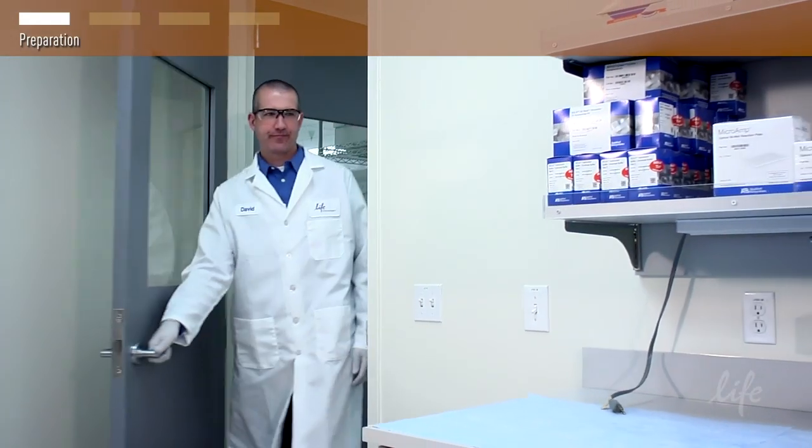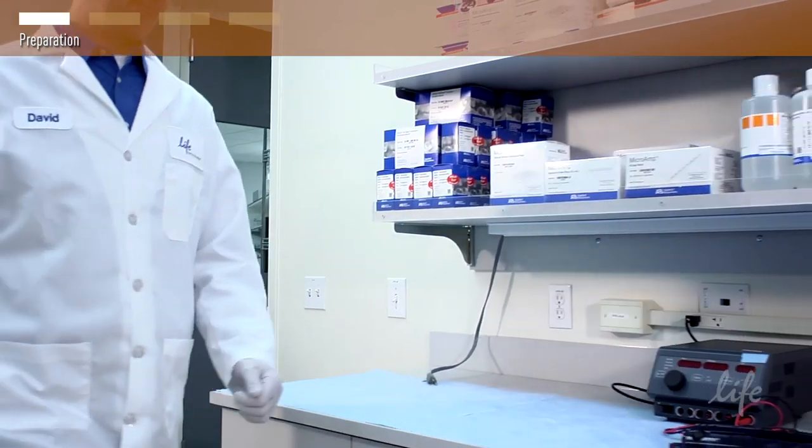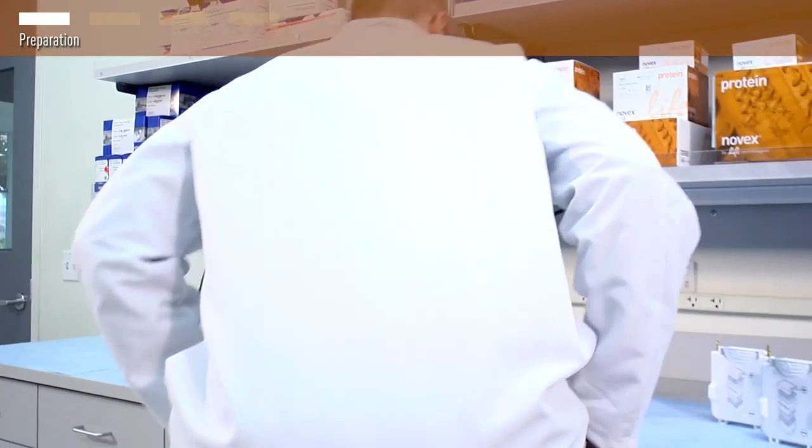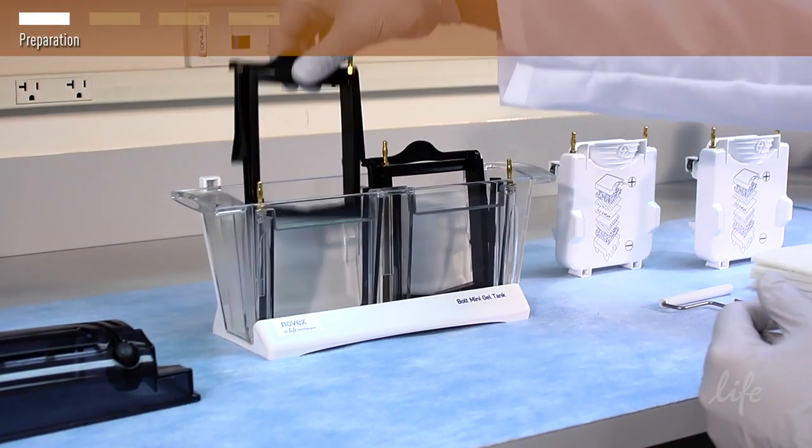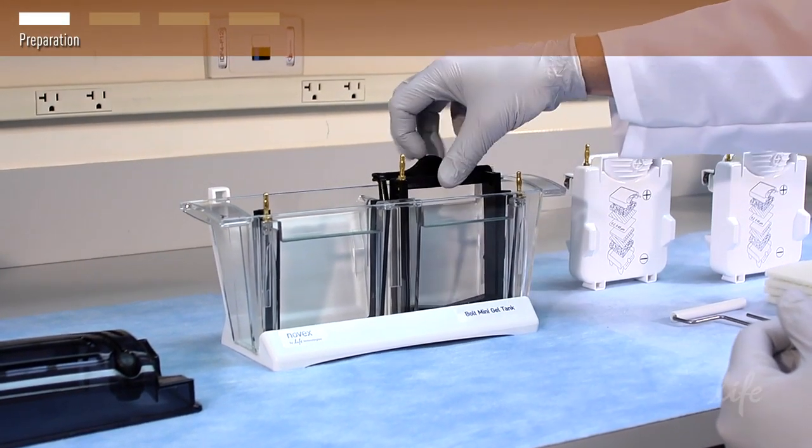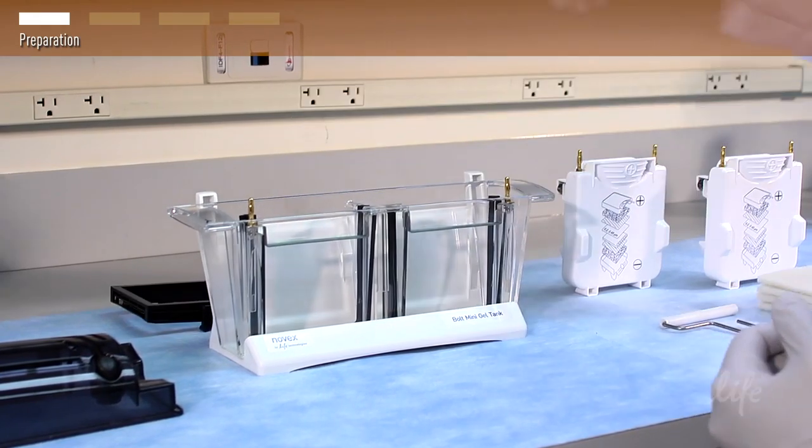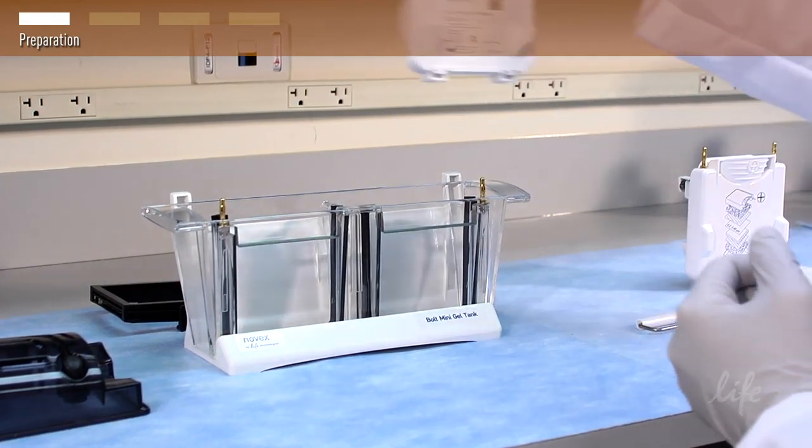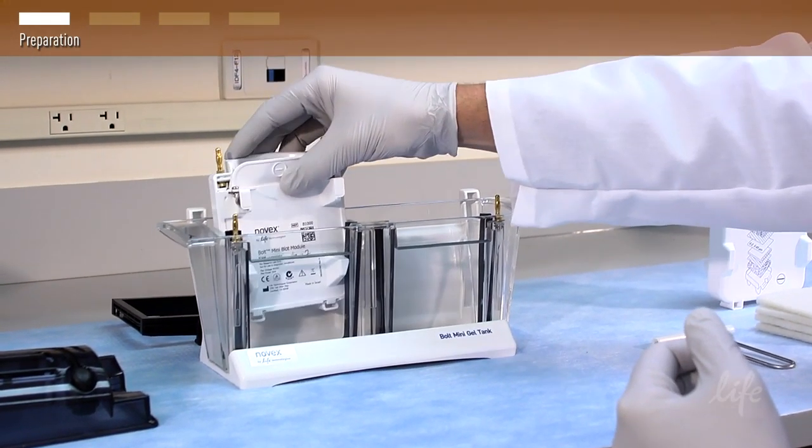In this video you will see how a Western transfer is performed using the Bolt mini blot module and tank. Make sure cassette clamps are removed before you set up your transfers. One gel is transferred per module and two modules fit in one Bolt tank.